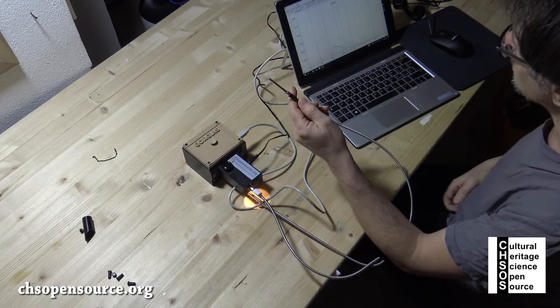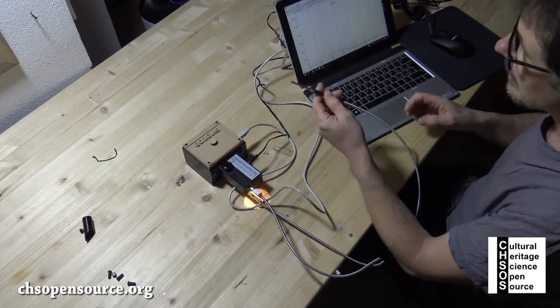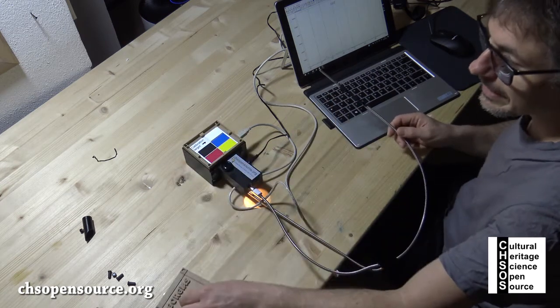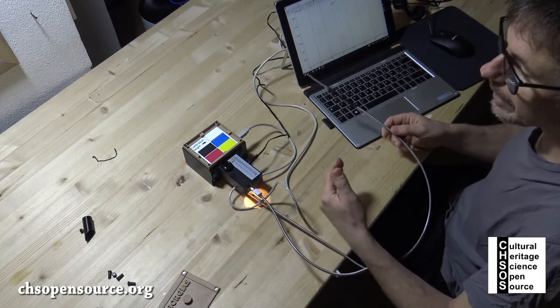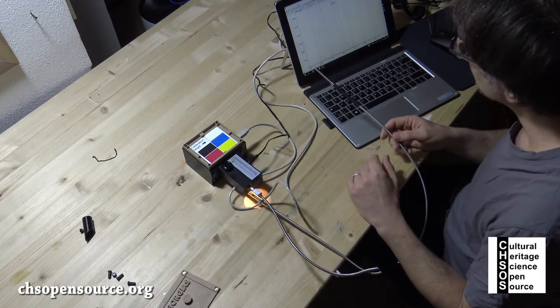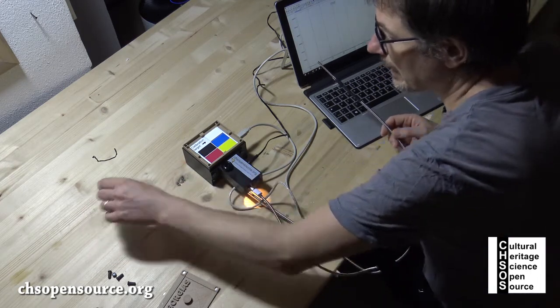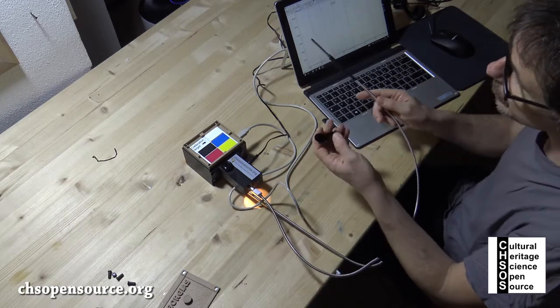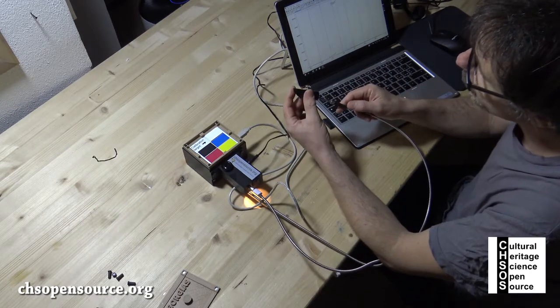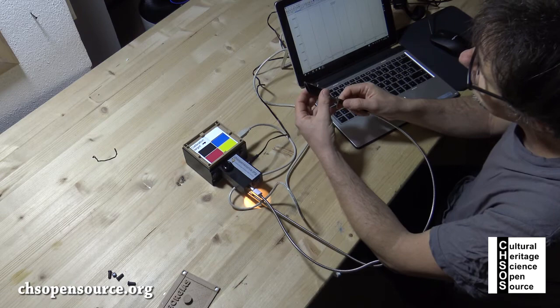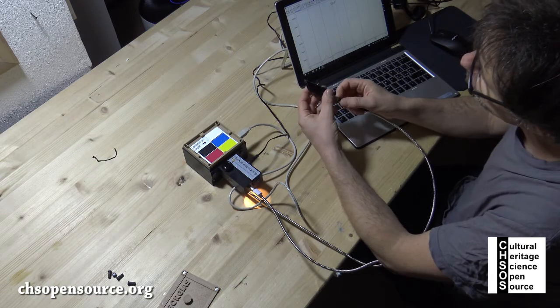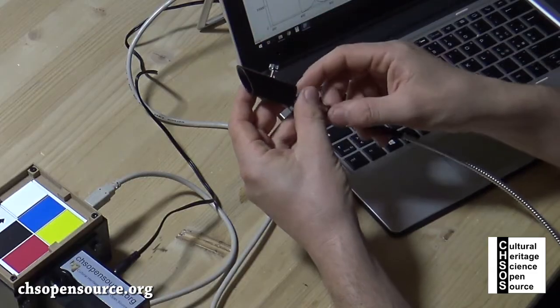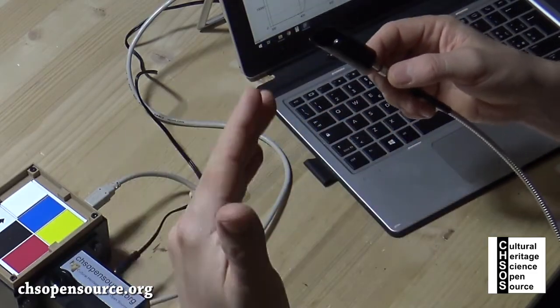You should have received a folder containing this material. This is the folder of the software, Gorgias software. Inside there is the executable Gorgias. You just have to double click on it and the software is opened.